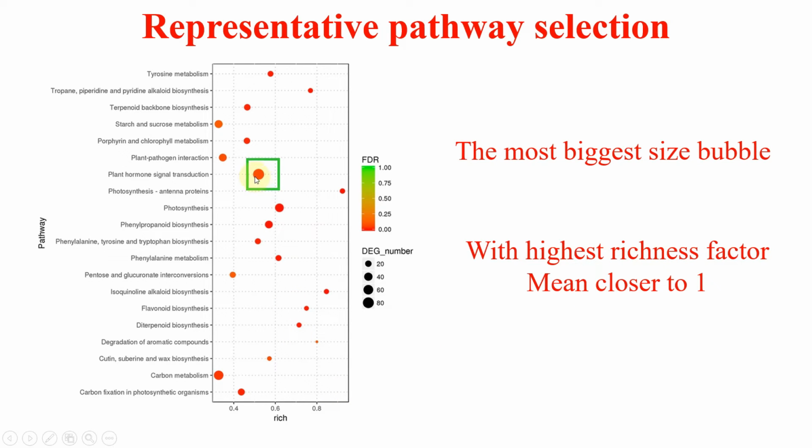Let's suppose there are two bubbles, one here and one here. You can see if there is one here, it means which is closer to the one. It means we have to select that bubble which is closer to the one. You can see this bubble and this bubble are actually of the same size, but we are selecting this one. Why? Because it is closer to the one.